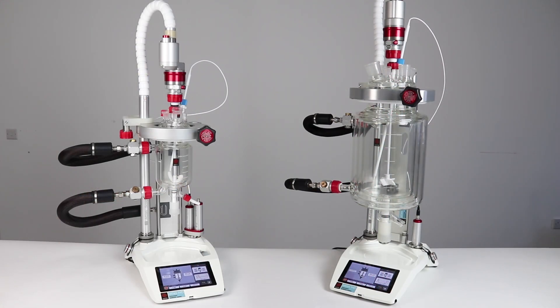Atlas HD increases the volume range of the system from 3 litres to 5 litres, only requiring a new scorpion pole, oil drain unit and vessel clamp to upgrade your system.